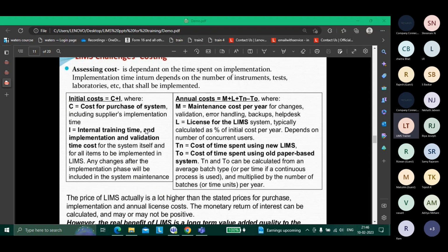But yes, maybe you will get some idea about how to do analysis mapping, because that's not very tough if you know what variation is, how your components are built in LIMS, what are those flags which decide which component is mandatory, which is optional, which is reportable, and what the basic queries are to pull out the analysis names and the sample numbers. If you know those basics, then you can apply your brain.